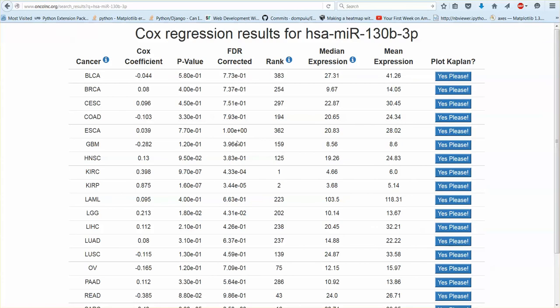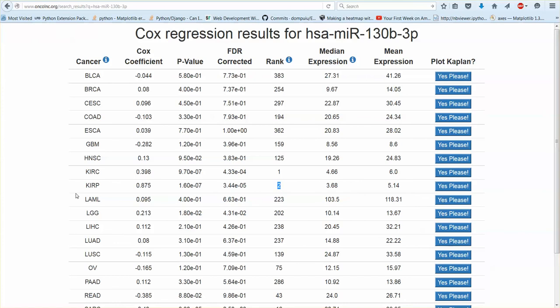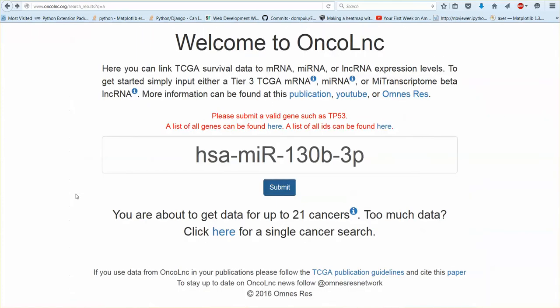Let's type that in there. Yeah so this one is actually really interesting because in KIRC it's ranked number one and KIRP it's ranked number two and they actually, I mean these are both kidney cancers and the expression is actually pretty similar as well. And the Cox coefficients are in the same direction so definitely looks like this microRNA could have a role in kidney cancer.